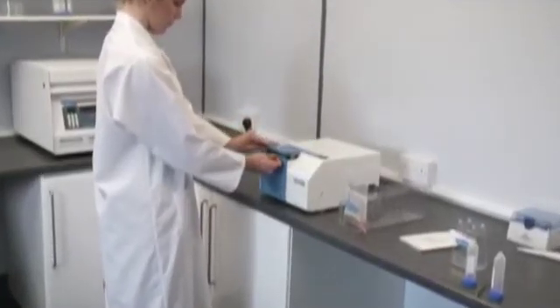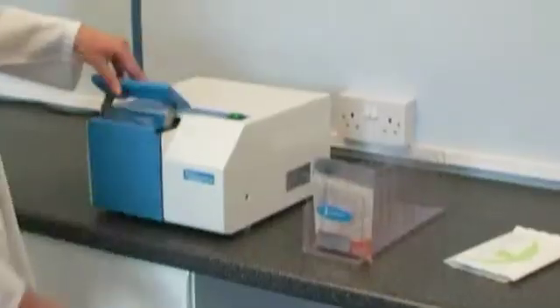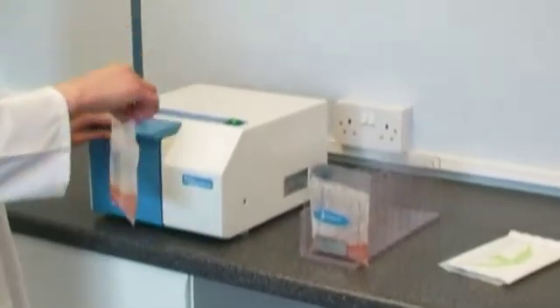Complete with adjustable process time and paddle speeds, the Biomaster can be adapted to your protocols or simply use the Auto Run feature for continual processing.